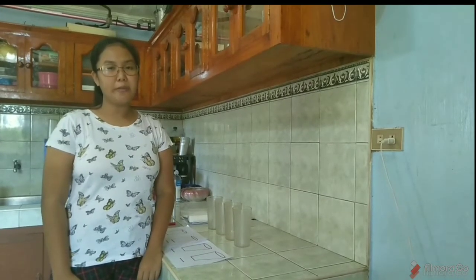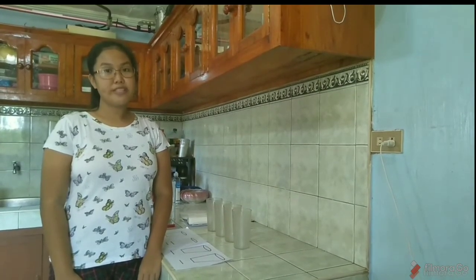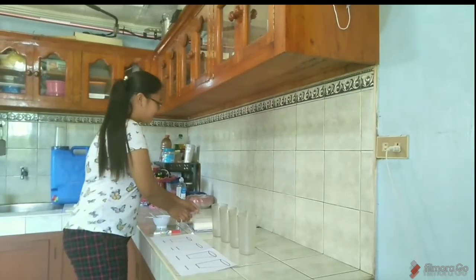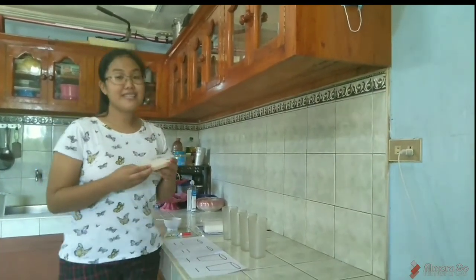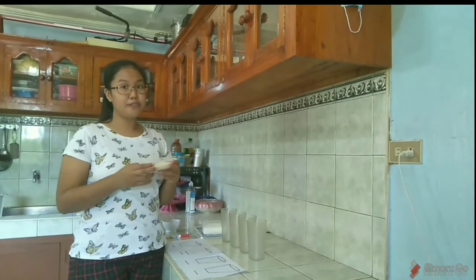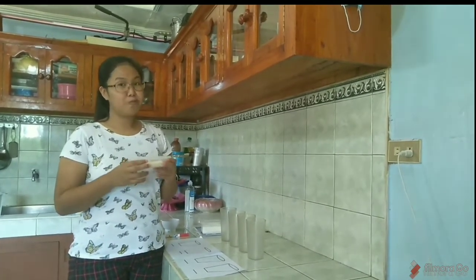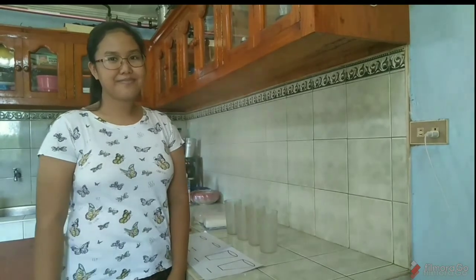In this experiment, we're going to use a very simple form of life, which is baker's yeast. This is a single-celled kind of fungus. By giving it air and food, it will grow and multiply. We're going to see which condition it likes the best.